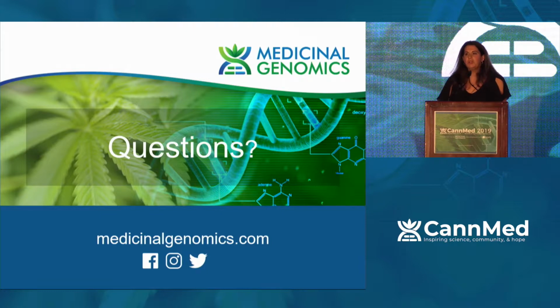Yeah, it could. A lot of it is basically viable versus non-viable. So in culture methods, you're only detecting living organisms, cells that are able to create colonies on your plate. Whereas in the qPCR, it doesn't distinguish between the two. Yeah, it's agnostic. Okay, thank you.